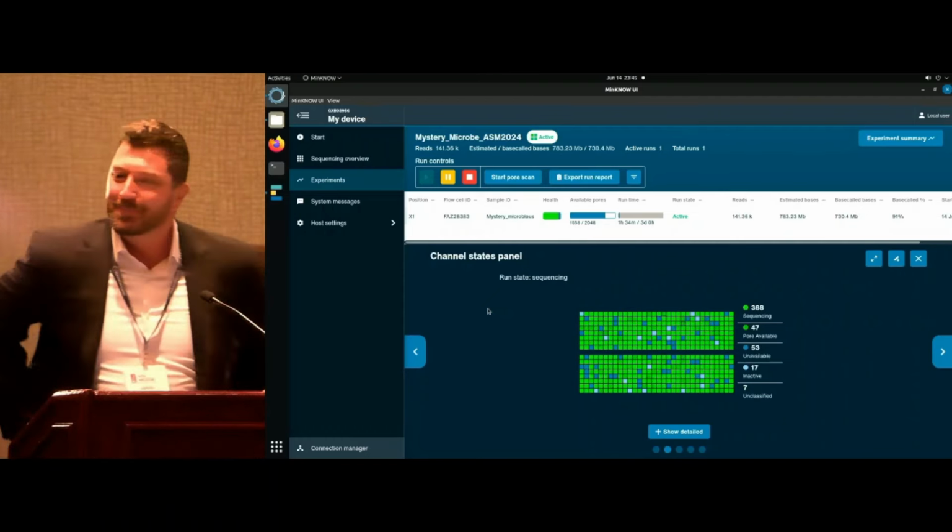We're at 141,000 reads now. Hint 5. It damages the water transport system within plants, including a prevalent crop in Georgia. Hint 6. It can cause visual clues of infection, including leaf scorching. Back to you, Aaron. Thank you, Carly.